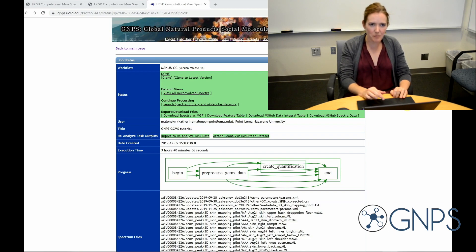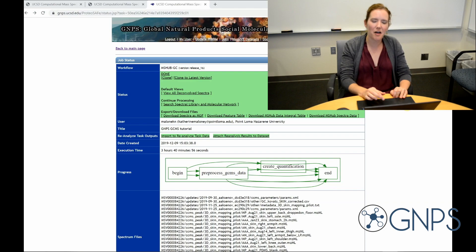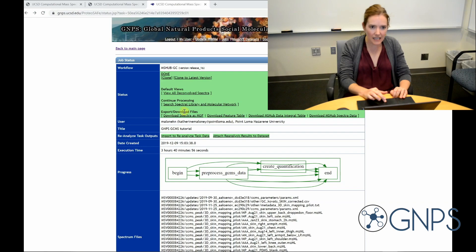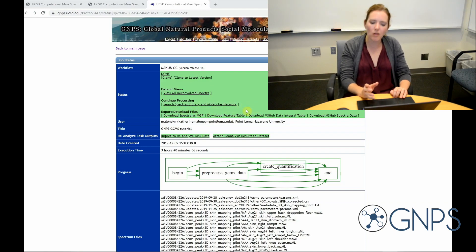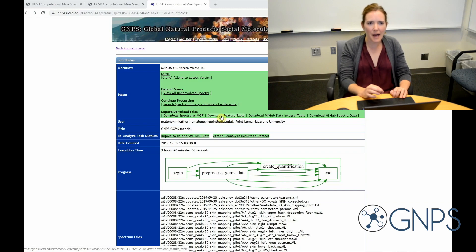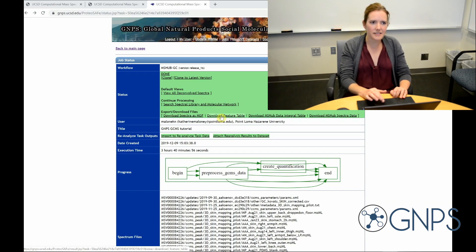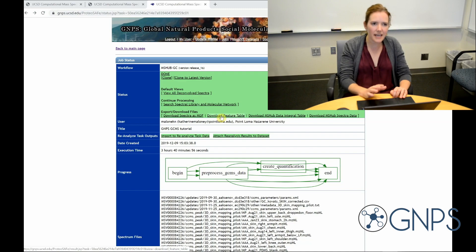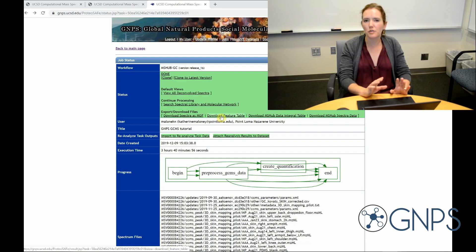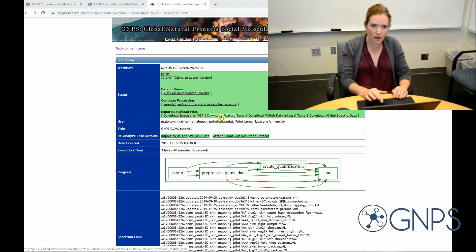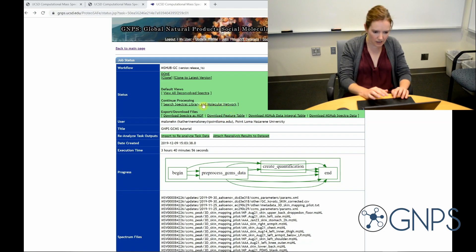I have the option from here to download my deconvoluted GCMS data in several formats. For example, if I click here, this will allow me to download the feature table in mzmine2 format. Using this table, I could do a whole bunch of statistical analyses. But in this case, I just want to do molecular networking and search the spectral libraries. So I'm going to go ahead and click here to continue.